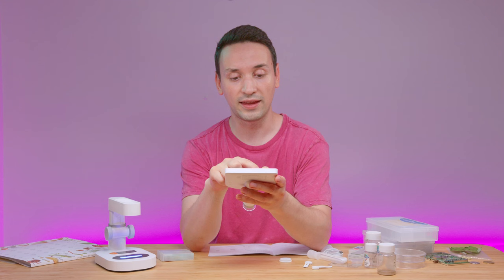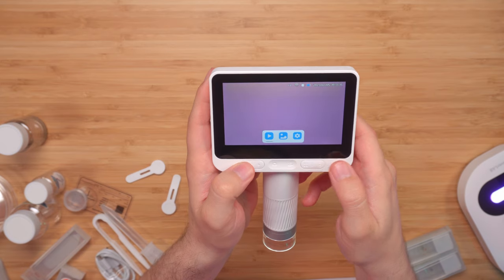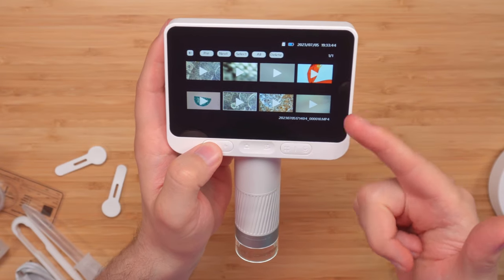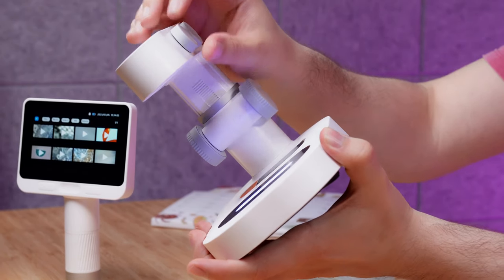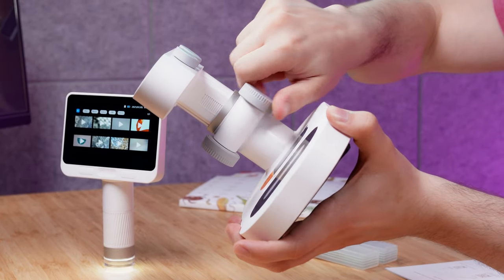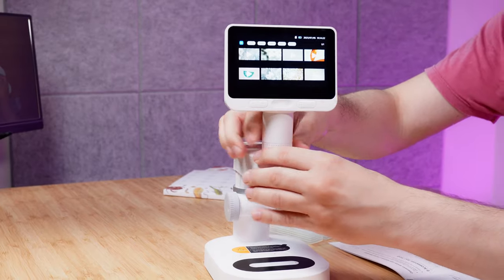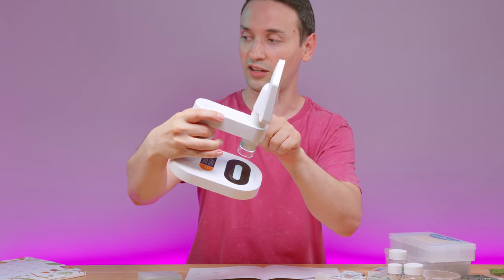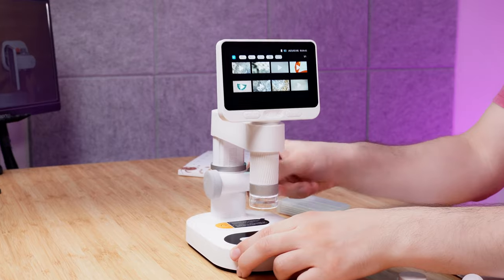In the settings you can adjust time, date format, SD card, and the Wi-Fi switch so you can view the unit from your smartphone. Back at the main base station, there are two knobs — one controls light on/off and the color wheel, and the other brings the microscope up and down. To mount it back, just slide it into the slot and lower it down.